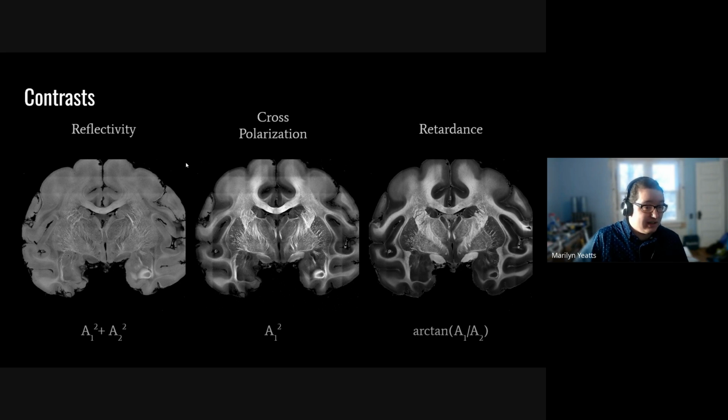It's just they're fiddly. And if we're not careful about it, then they can get a little bit long and cast shadows on my image. If that happens, I unfortunately do not have a way to recover the data that would have been under that, because that data just wasn't recorded.